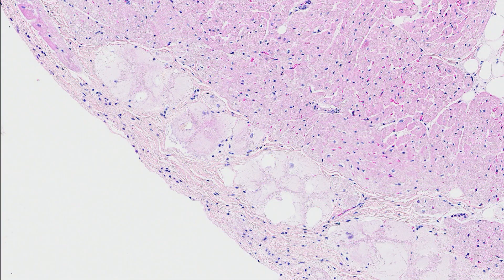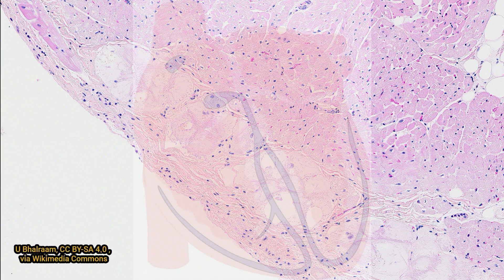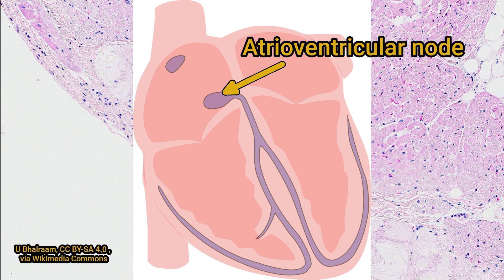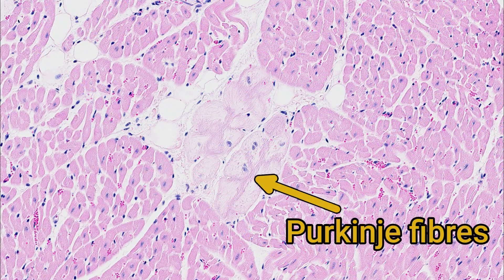Just under the endocardium, you'll often find Purkinje fibres. These are modified cardiomyocytes that carry electrical signals from the atrioventricular node to the apex of the ventricles without exciting the surrounding muscle. They're usually separated from other cardiomyocytes by fibrous tissue to insulate the electrical signal. Occasionally, you can find them in the cardiac muscle interstitium, also surrounded by thin sheets of collagen.